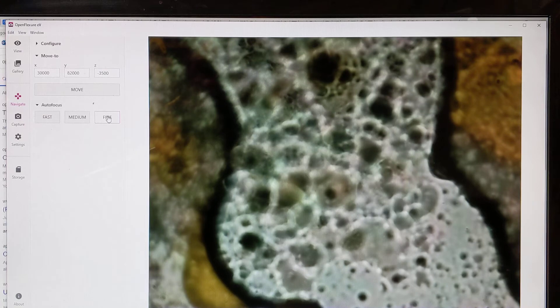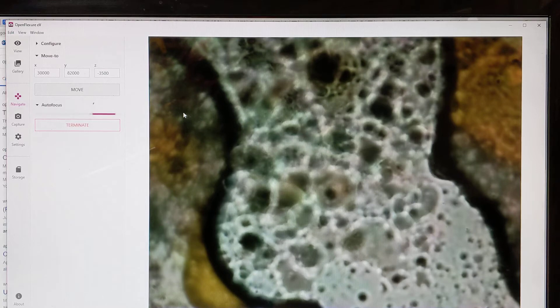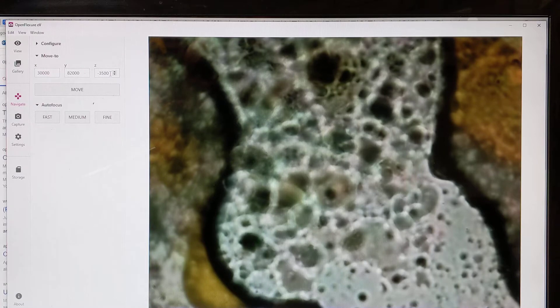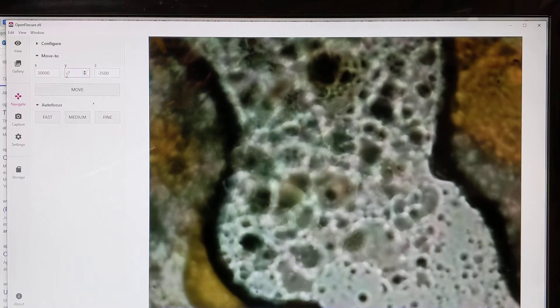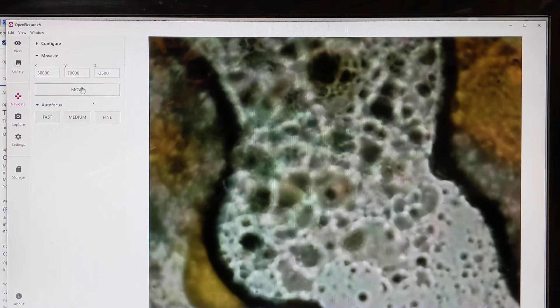It didn't do much from there. Let's go for a find. It may be as focused as it can get there. So we can scan a little bit — this is at 82,000 right now. So if we go to 70,000, we can get a good movement going.